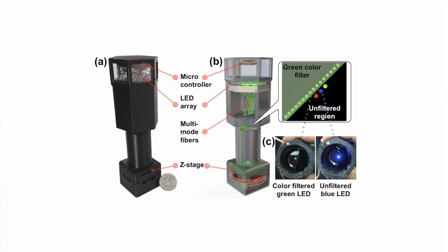There are also different ways of doing this reconstruction. This is actually a color microscope. One of my students is presenting this work tomorrow around noontime. Alon will present this work. So I won't go into the details, but if you are interested in how you can also create a color imager, lens-free color imager, based on the same lens-free holographic technology, you should see his presentation, again, around noontime tomorrow.